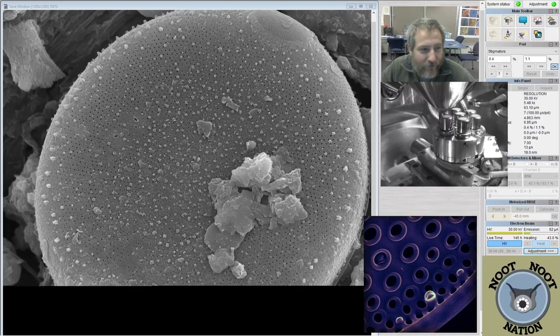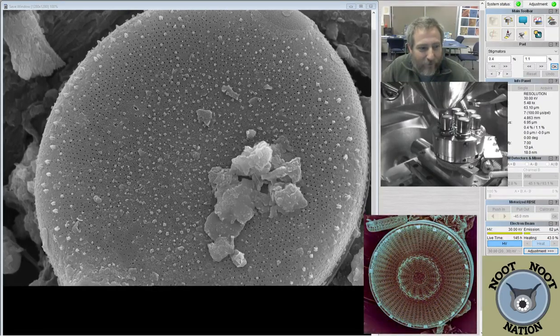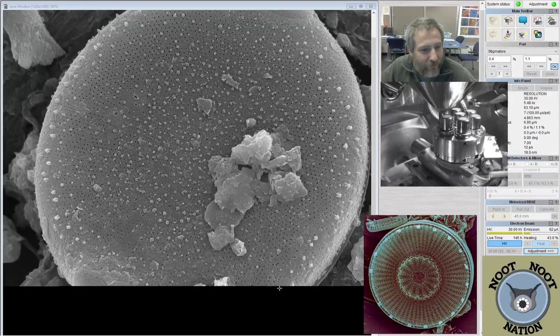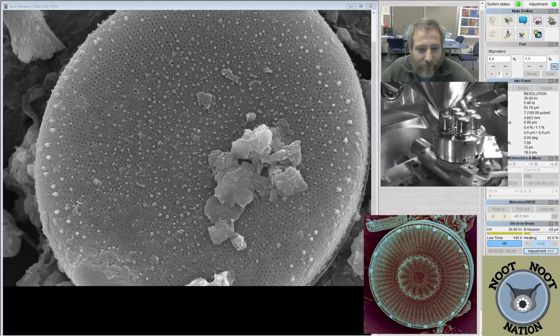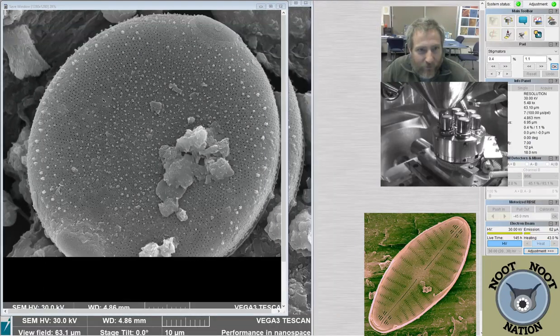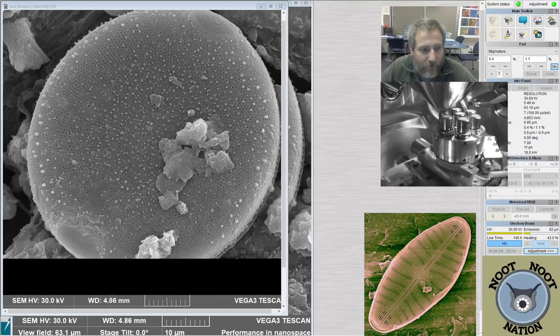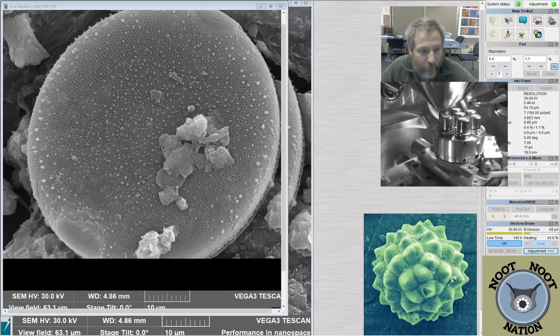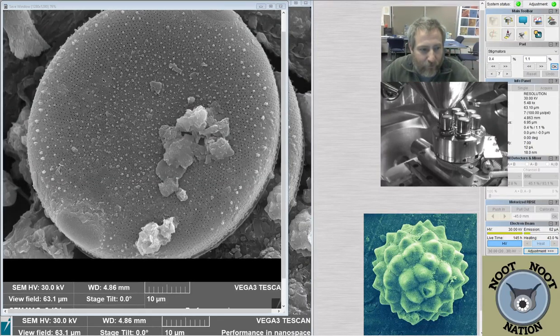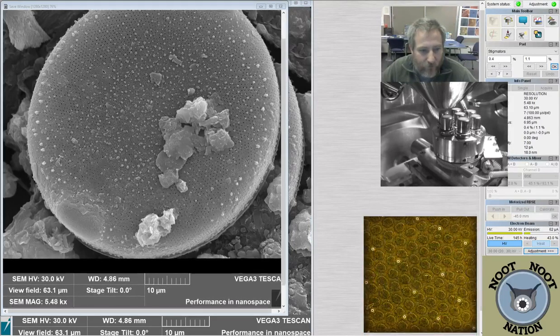But you can see these little spines, it looks like somebody came along with a cake decorator and decorated this thing. They're like perfectly little cone-shaped spines all the way around over here as well. It's pretty neat. And yeah, here's the ocelli. I can zoom out a little so you can see all of it at once. Here's one, here's the other. And there's a little bit of mucilage that they usually put out on these things. Sometimes they live in colonies, and they'll be tied together with their neighbor by little mucilage pads. So it's kind of cool.